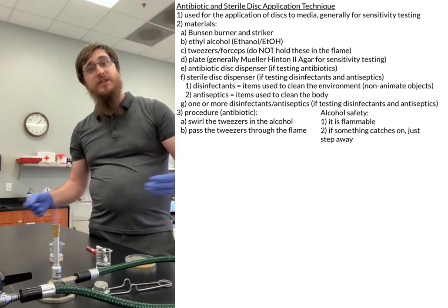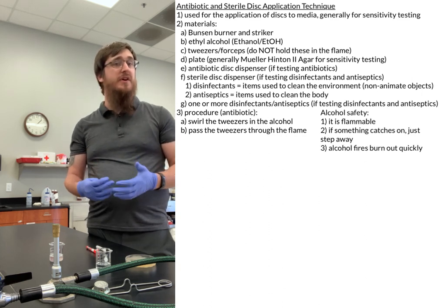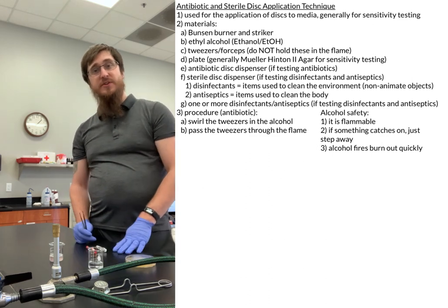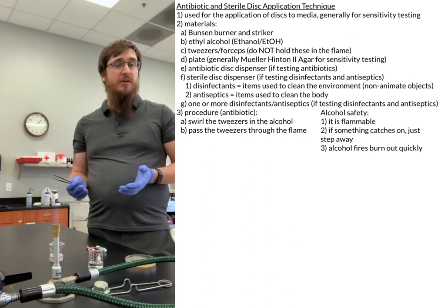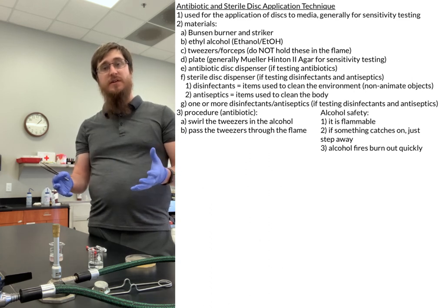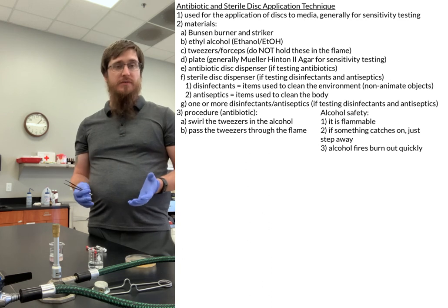Walk away. It is going to be an alcohol fire, and this alcohol fire will generally burn out very, very quickly. If for some reason the fire is inside of the beaker, you can just put a larger beaker over it and it's going to kill the flame inside of there. All around though, alcohol fires burn out quickly on their own, so if for some reason something catches on fire here, that is part of the alcohol, just step away and let it burn off.